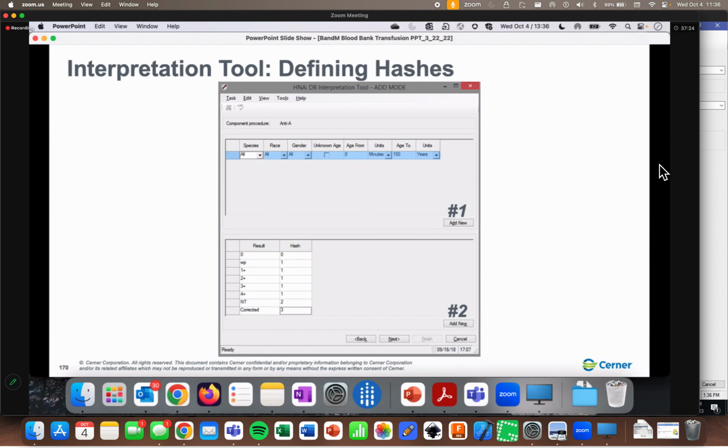BB result entry, unlike its other resulting cousins, if the interpretation pattern is not defined at all, nothing is in there for that particular DTA, then it is going to... my brain train just derailed again. I don't know where it went, off into the ether somewhere.